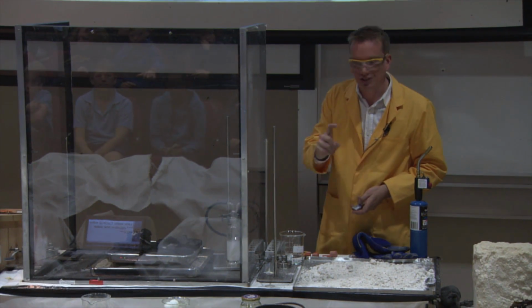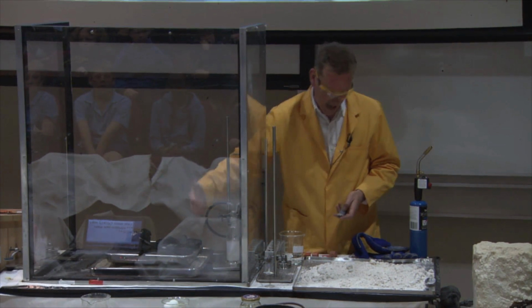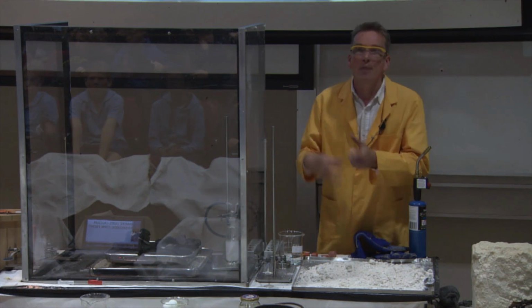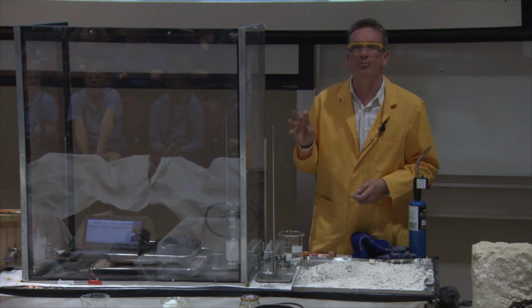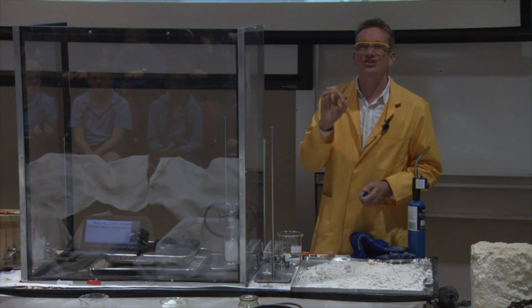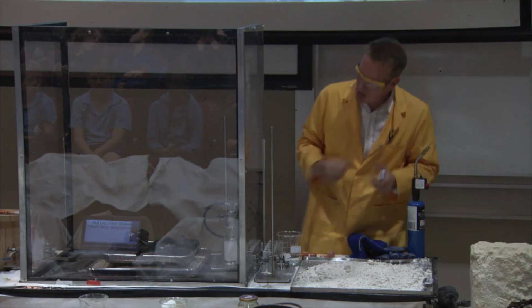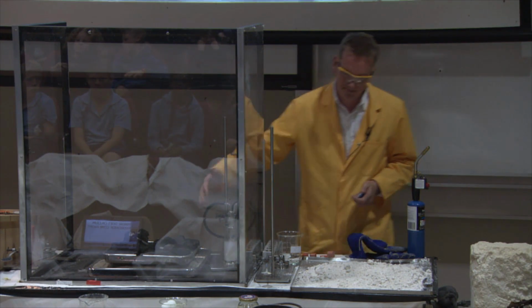But the chemical test for this was bubbling the carbon dioxide through the lime water here, which is calcium hydroxide. And the milky colour that you see there is due to a precipitate, fine particles of calcium carbonate. That's the test there for carbon dioxide: if it turns the lime water milky, this milky colour that we see here.